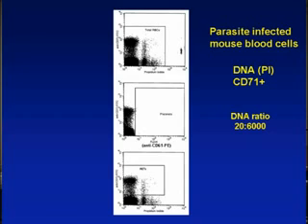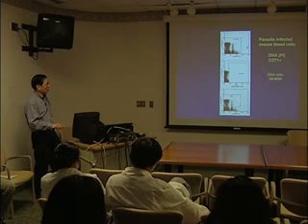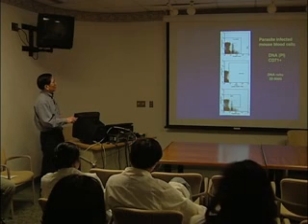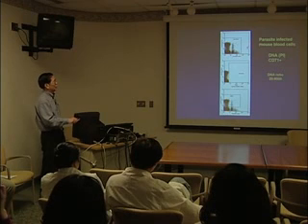And remember the definition for the micronuclei, when you look at the microscope, it has to be less than 1/3 of the diameter of your nuclei. So that when you do this kind of gating, you can also use that criteria so that your DNA content will be in that approximate neighborhood. But anyway, we just follow it. So you have this additional information here. You exclude the immature red cells.